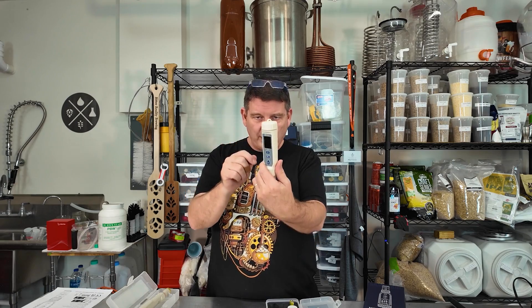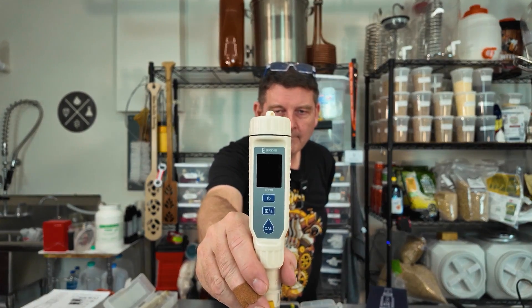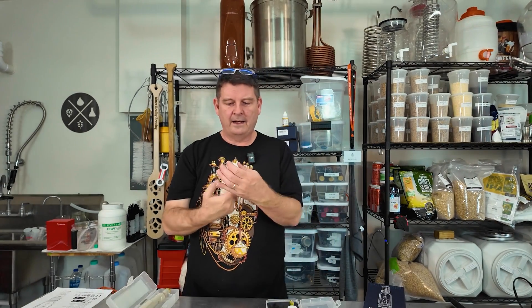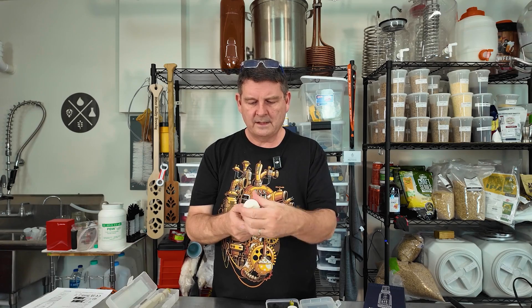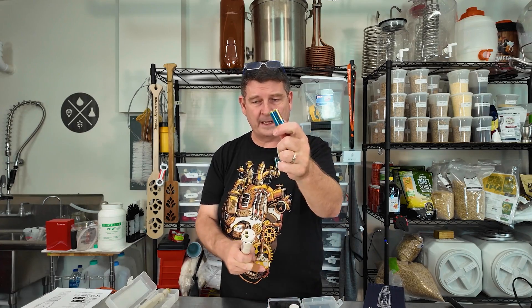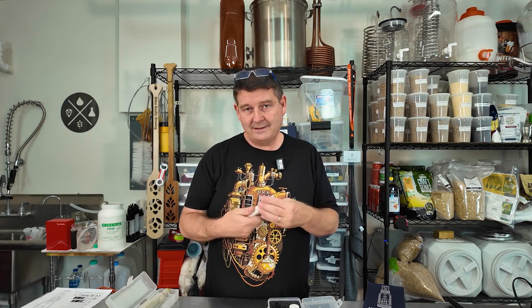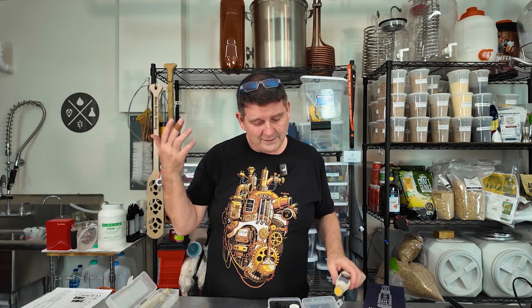It's got this little piece hole here where you can put a string and hang it — I would keep it in the case just to be safe. Up here is the battery compartment. It uses regular typical AAA batteries. That's it, nothing special. This one over here used watch batteries — I had to go get some at a drugstore one time, and it wasn't something you could just buy anywhere. So that's what's really nice, you can use just regular triple A's. I always have those on hand. I live in Florida, we have hurricanes, we have to have batteries.